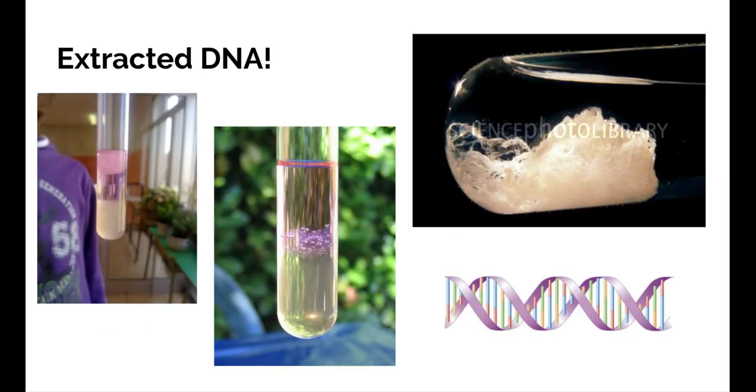As I was saying, this is what extracted DNA looks like in solution. As you can see, it's that really clear, kind of gooey looking block in between the layer of alcohol, which floats on top, and the layer of soap and Gatorade or salt water, whatever you want to use, that floats on the bottom. They separate because of a density differential, which is why it all kind of isolates in one spot.